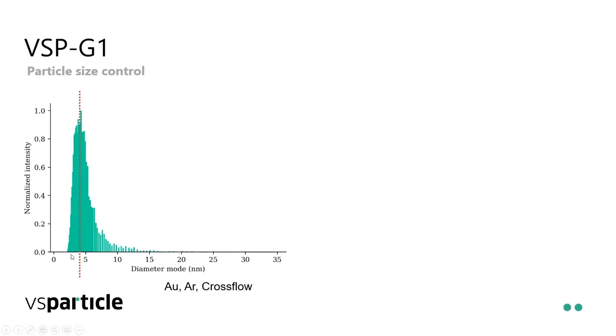And what you see is that we get primary particle mobility sizes of around 4 nanometers, and with TEM you'll see about the same thing, 4 to 5 nanometers in particle size, with a bit of a tail going to bigger particles. Those will be agglomerates, but also some smaller particles. All in all, it's a pretty narrow distribution for many applications, and there are ways of making these even narrower using that same DMA. But that's a topic for another presentation.